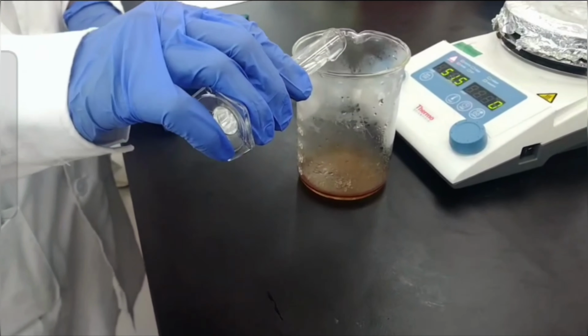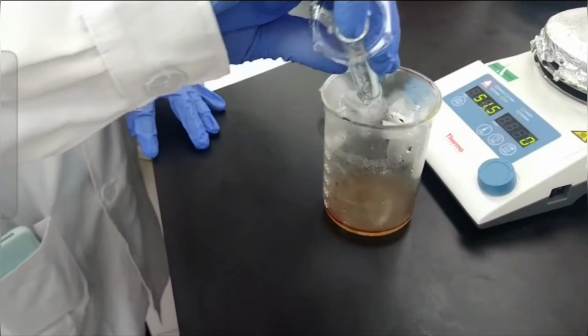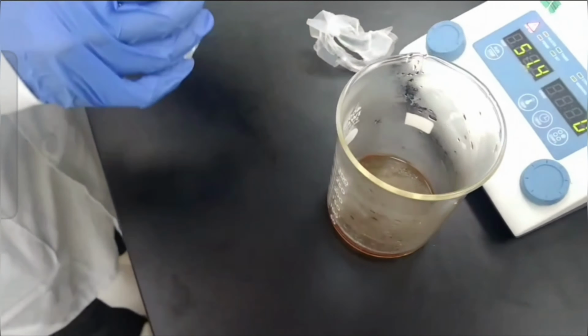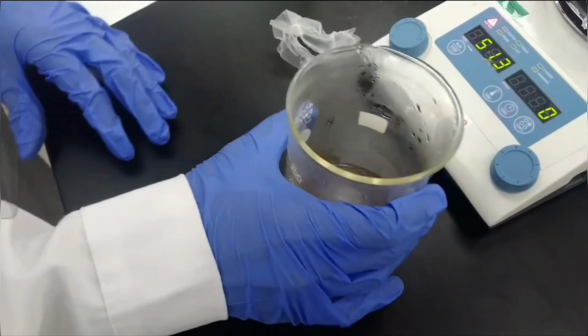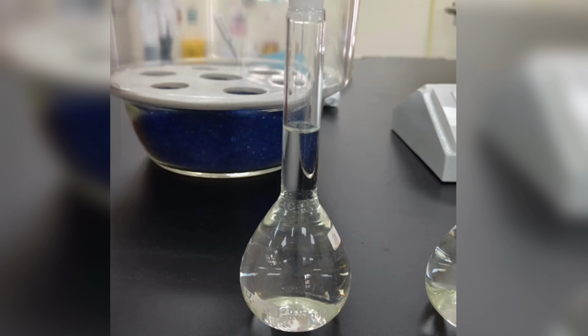We let the nitric acid and used cooking oil solution cool down to room temperature, and then we add 10 milliliters of deionized water to the mix. We then transfer the mixture of concentrated nitric acid and the filtered used cooking oil to the volumetric flask, and then we fill the volumetric flask to the line using the deionized water.